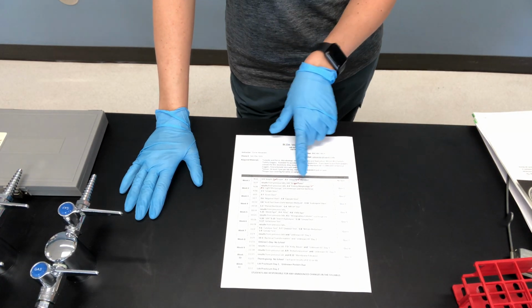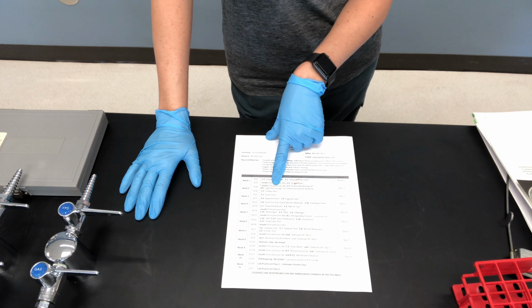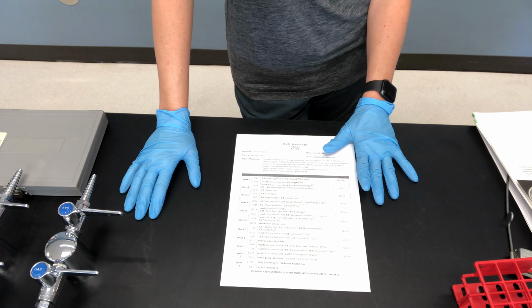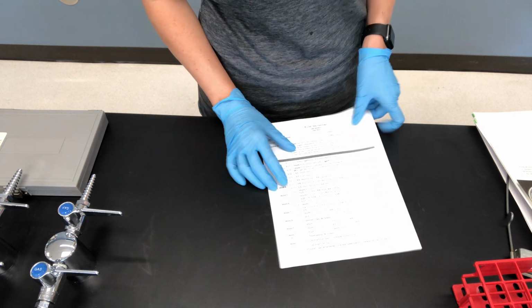So we are moving on to the second activity for Tuesday of week 2, which is light microscopy, lab 3-1. Also learning how to do oil immersion and looking at some live living bacteria. So that's where we're at, cruising through our syllabus here.